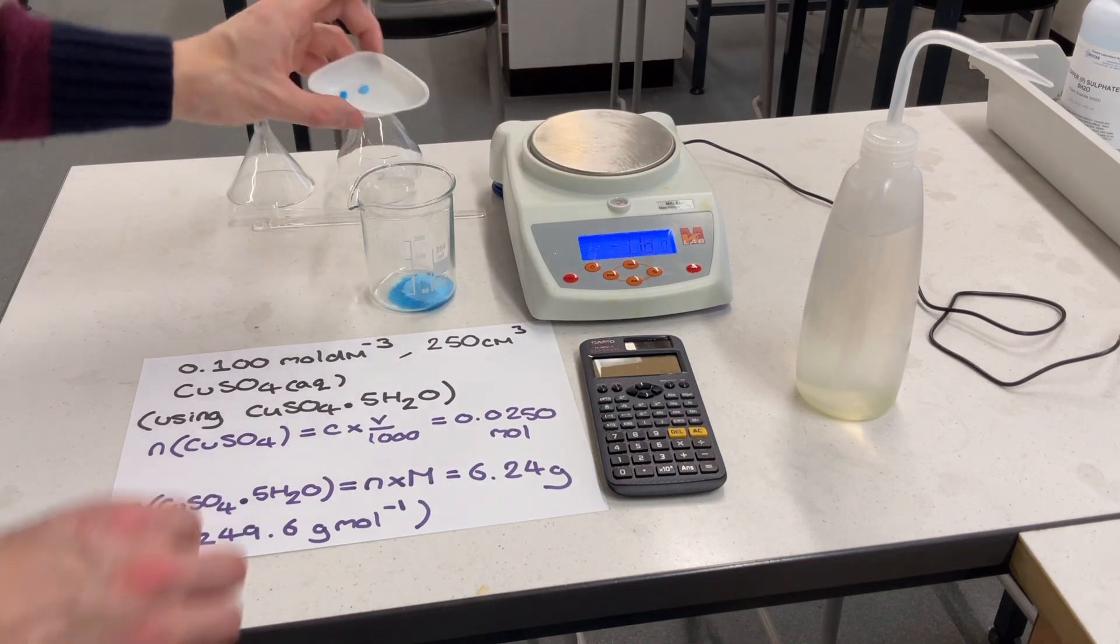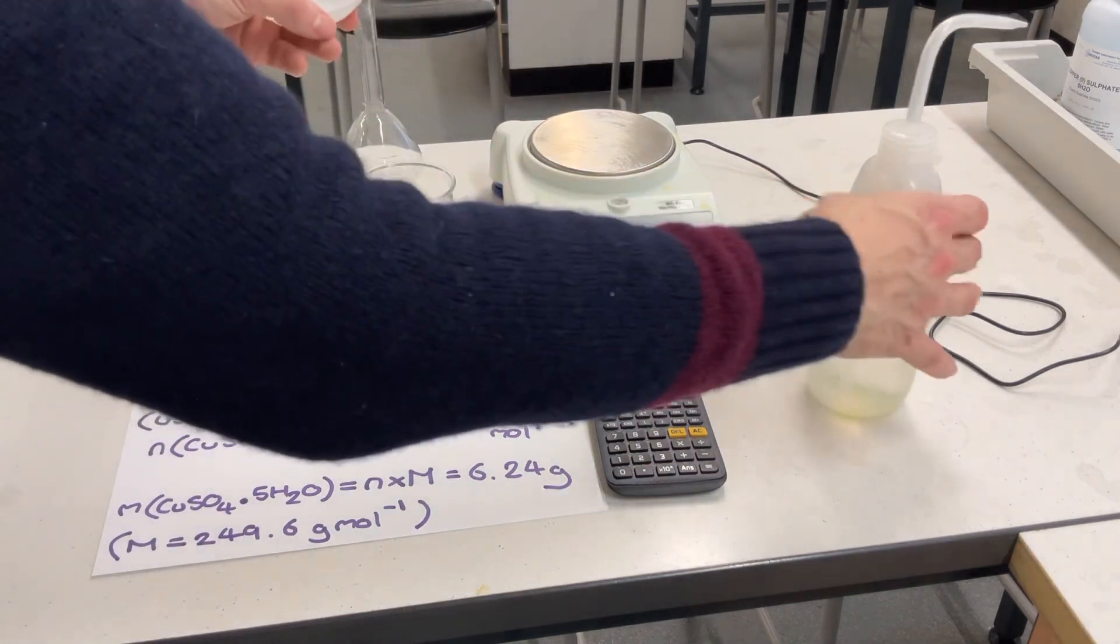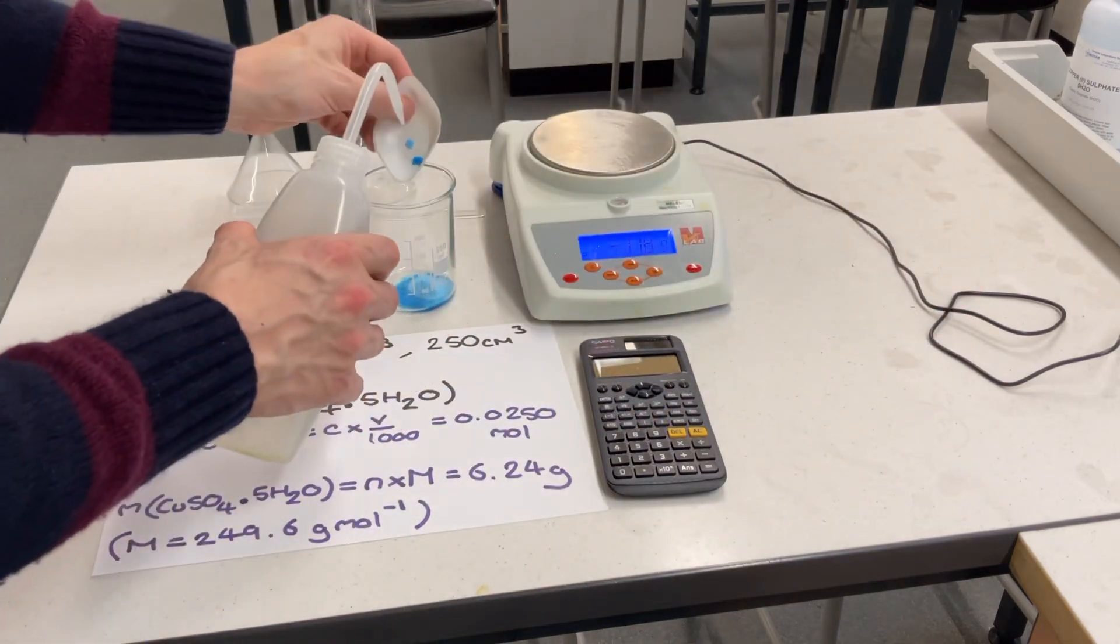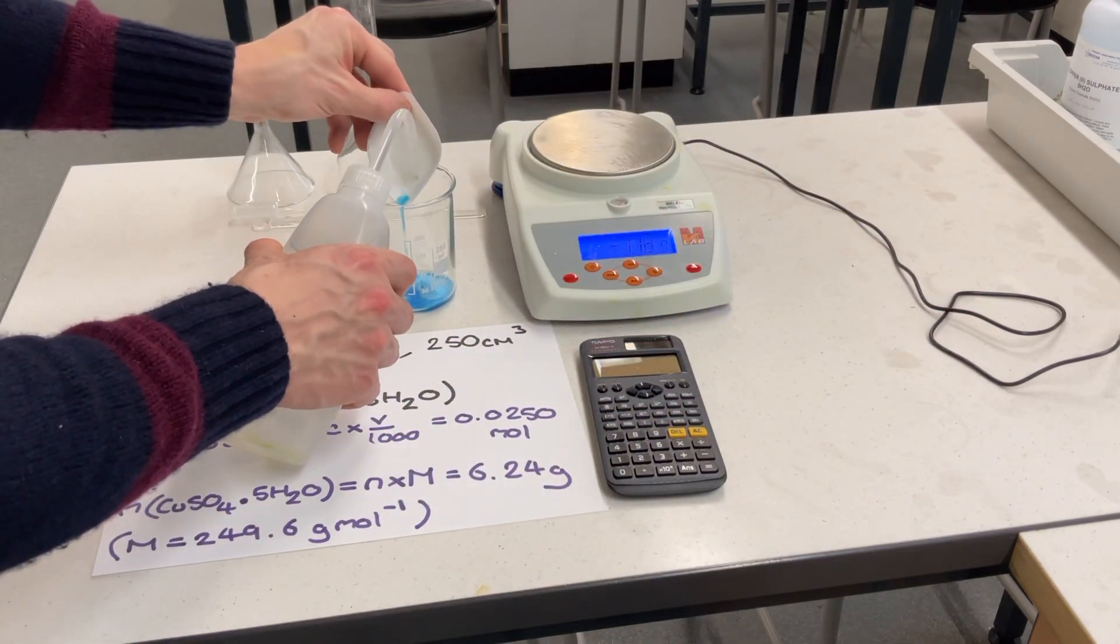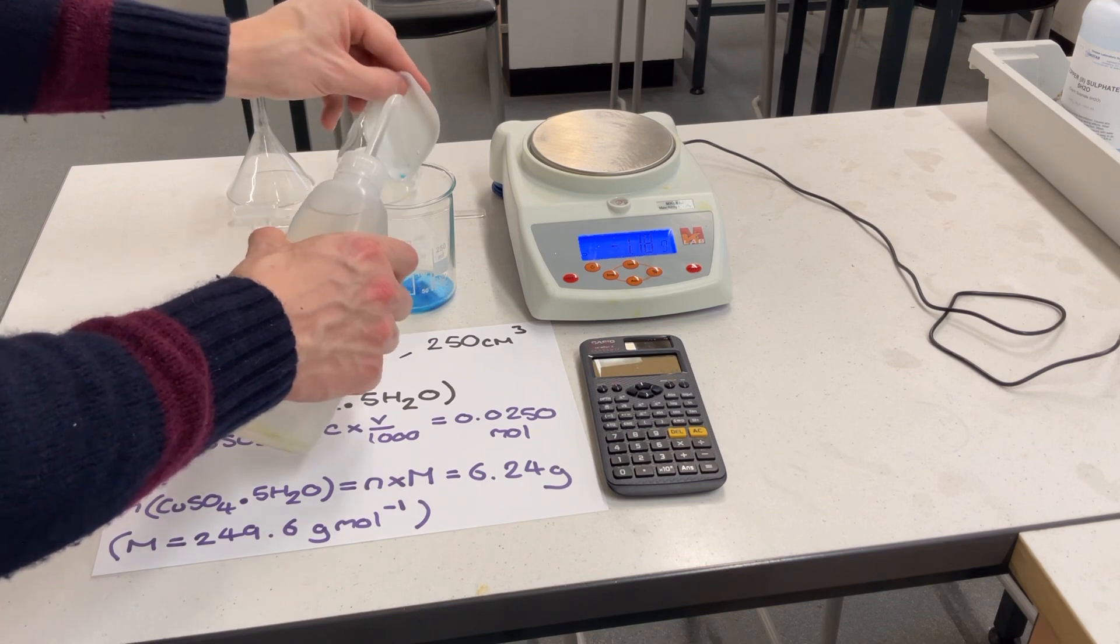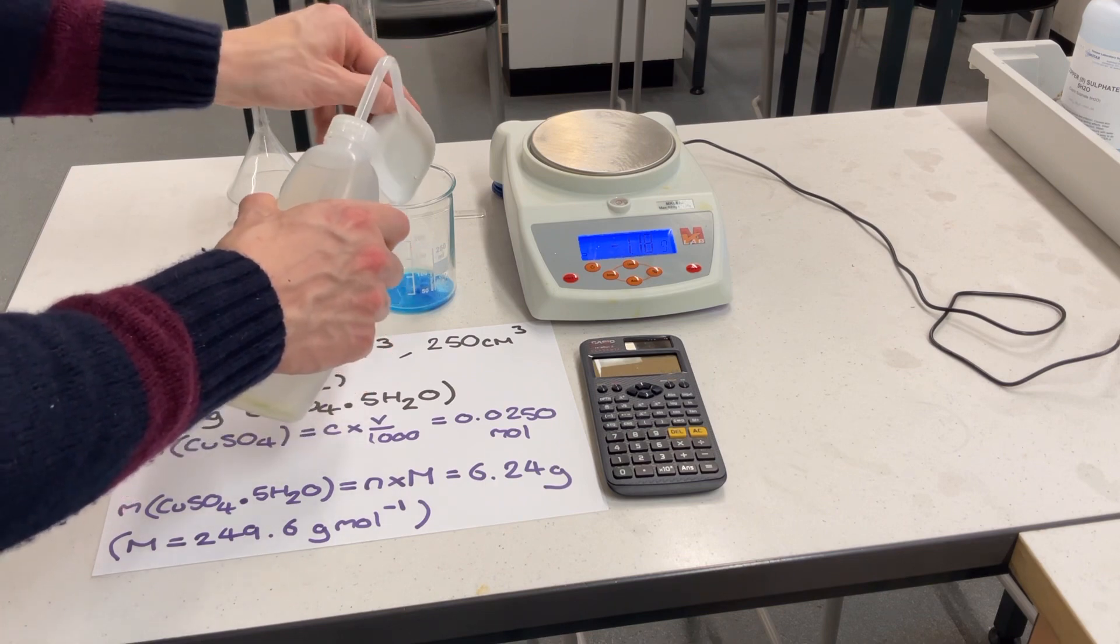Step 2: Transfer the solid to a small beaker and dissolve the solid in a small amount of deionized or distilled water. Make sure to transfer any washings from the weighing boat into the beaker at this point.